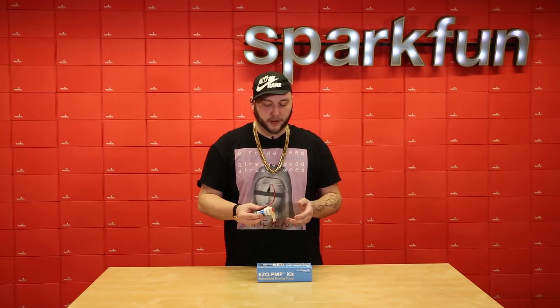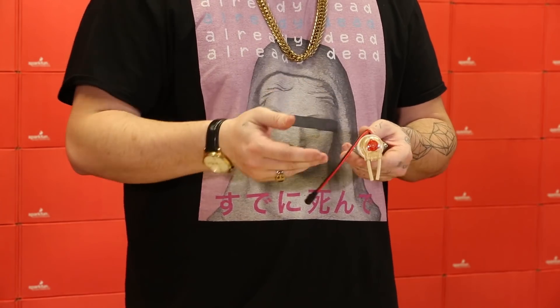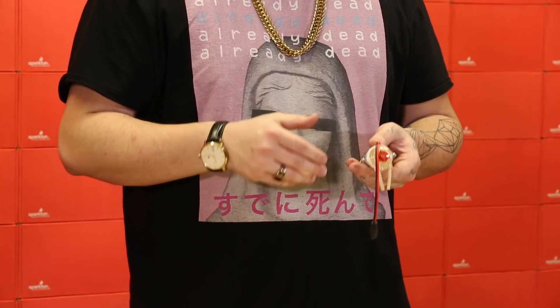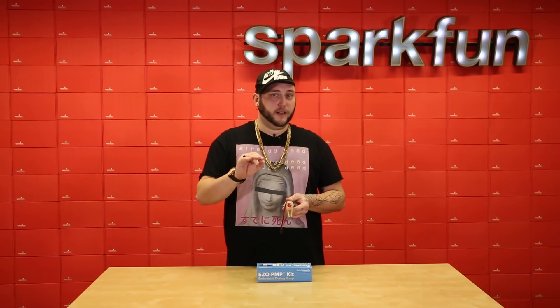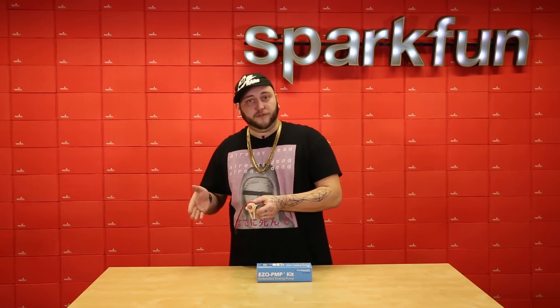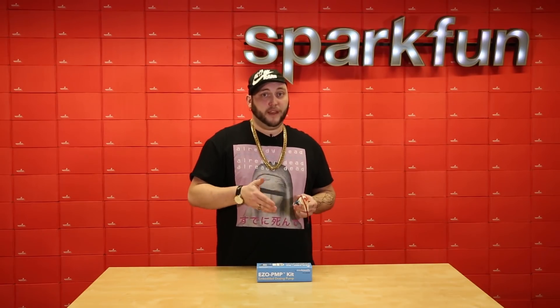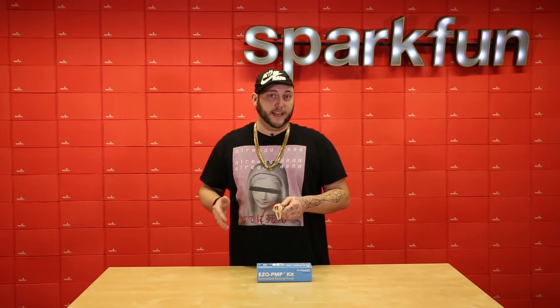It has onboard calibration. You just hook it up to a fluid source, prime the pump so there are no air bubbles in the tubing, and then tell it to dispense a particular amount of fluid. You measure that fluid and tell it how much it actually dispensed.